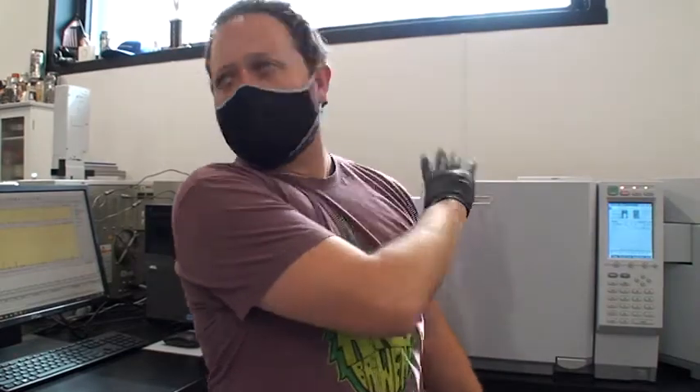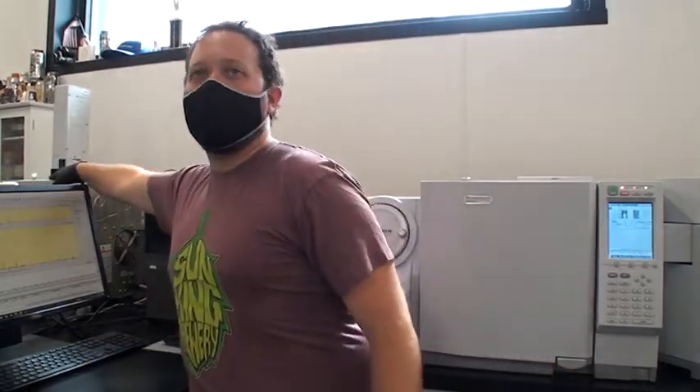We want better beer for everybody, because the better the beer around here, the better Indianapolis looks. Any testing we covered — microbial checks, ABV, IBUs, color, all those metrics — we can do. We're very good at ABV and do that for a lot of people. IBUs are tested on the UV-Vis spec. ABV uses a separate smaller gas chromatograph that's quicker and cheaper than the full GC-MS setup.